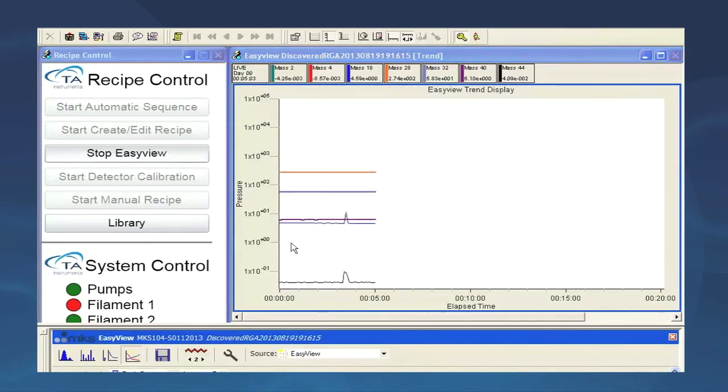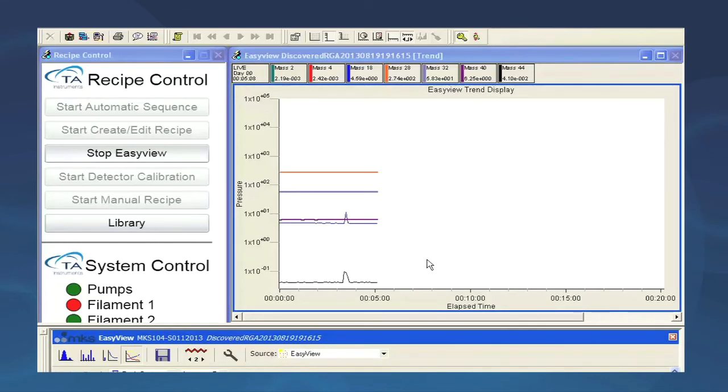An easy check for the detector response is to breathe into the TGA furnace and check for the response of mass 44 and mass 18 associated with carbon dioxide and water. You should see an immediate jump in these relative concentrations.